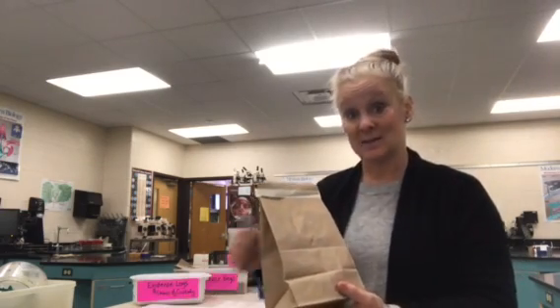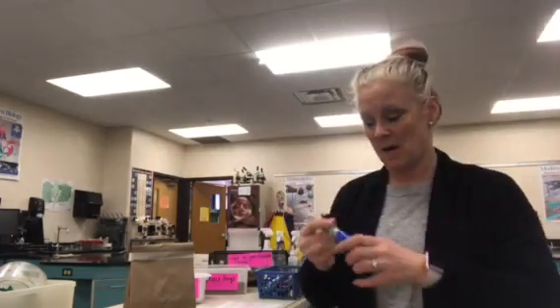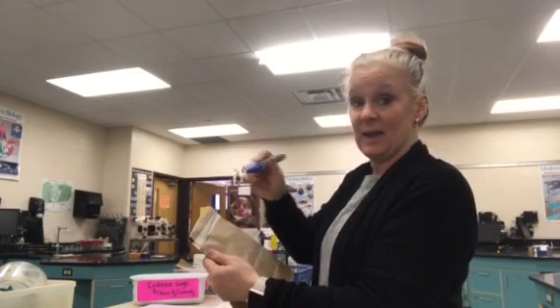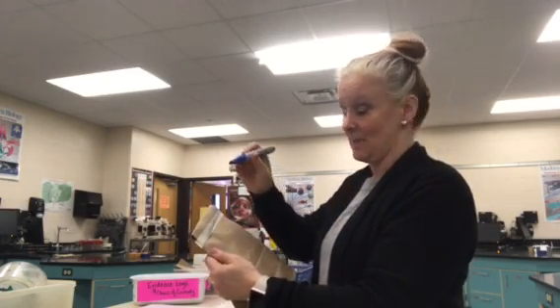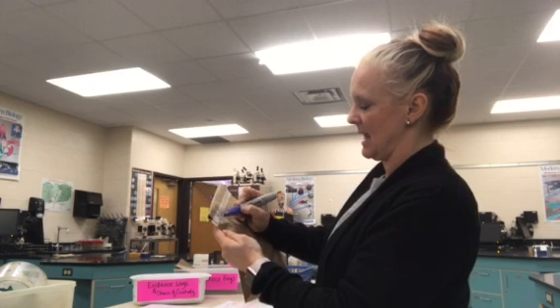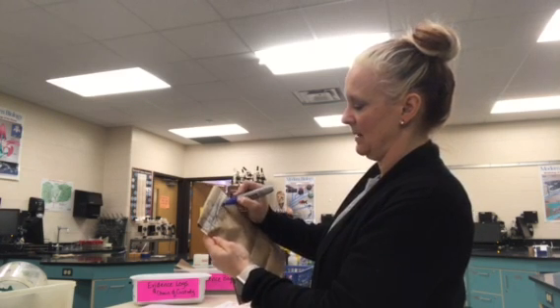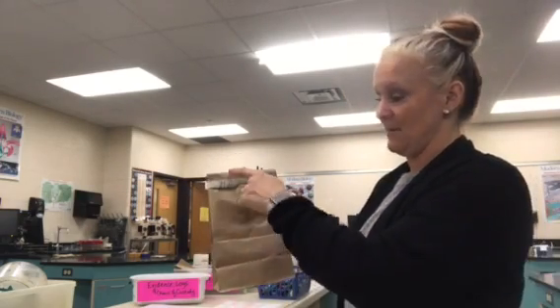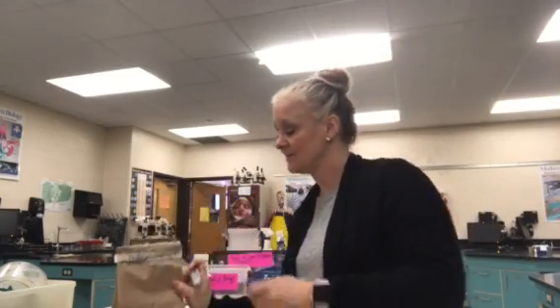So what I'm going to do as an evidence collector is take a marker, and I'm going to sign on that tape above and below, so that the marker goes on the bag above the tape, and the bag below. When I do this, I need to sign really super big. And so now you can see that there's my name above, below, and on the tape. This makes it much harder for somebody to unseal it and reseal it in the exact same position as where I was writing. Okay, so that's one way that we ensure the integrity of our evidence.